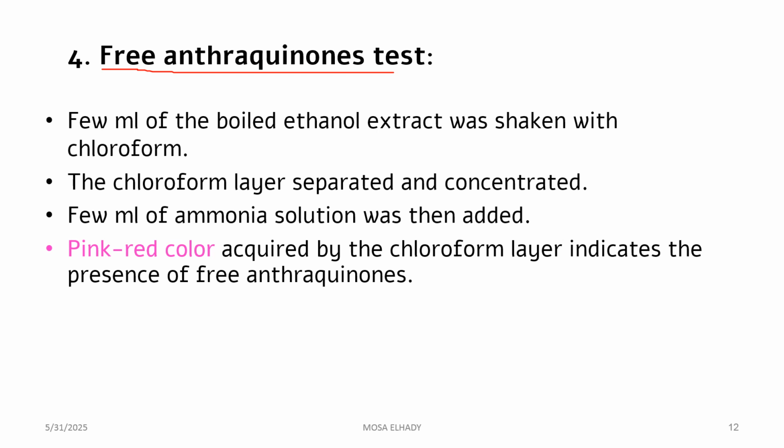You should also note that, in contrast to anthraquinone glycoside, here for extraction we start with ethanol extract.